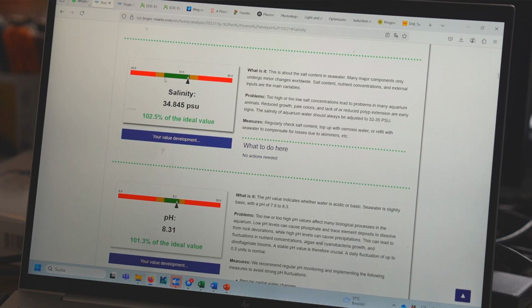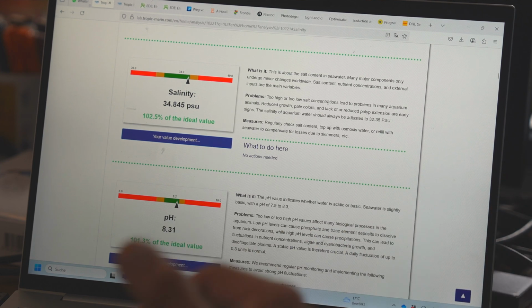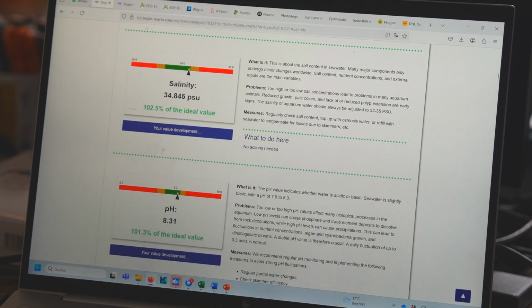Basically, the recommended range is green, the yellow is something you should be a bit wary about, and red is an area you shouldn't be in for too long, depending on the whole picture. So some things are not as dramatic as others. It also tells you what it is and what can happen if you're outside the range. For instance, for salinity here, what happens if you have too high or too low salt concentrations, and how to measure it and what to do.